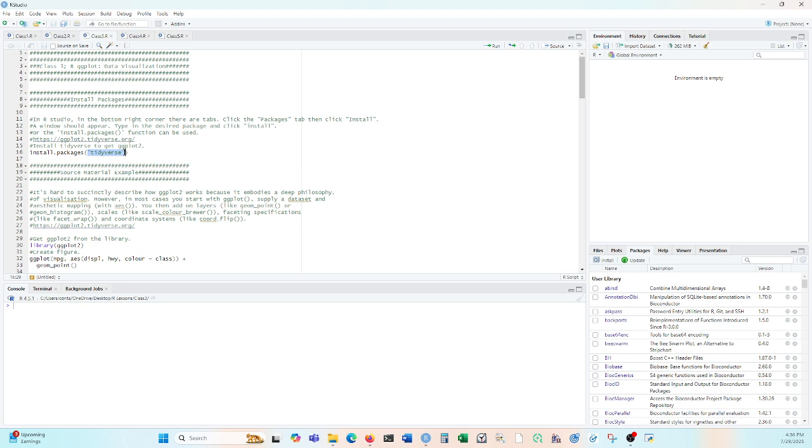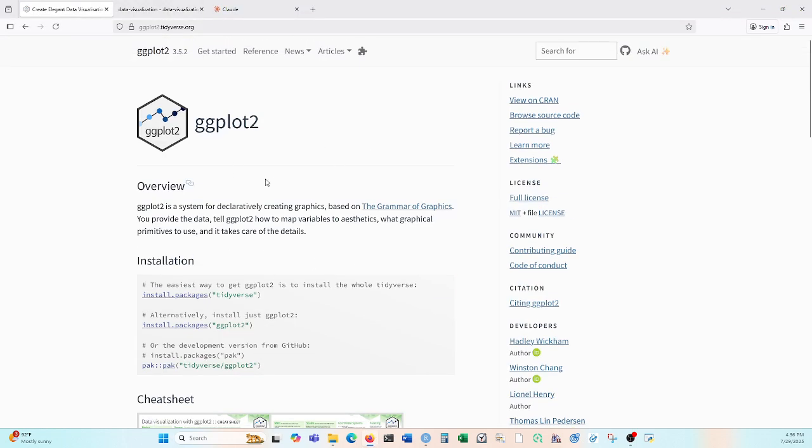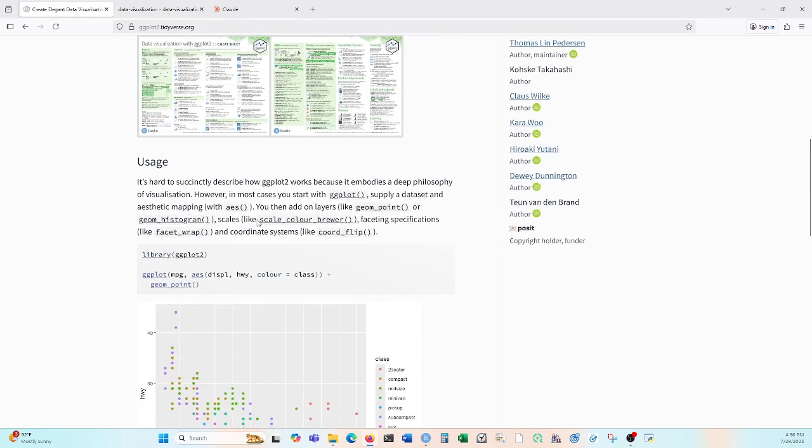And a tool we're going to be using today is ggplot. ggplot is a data visualization tool that is layered in various ways, and this layering allows it to be used for customization of visualization of data, and is very good. On the actual website, there's a very good tutorial right here, which a lot of this class is based off of.